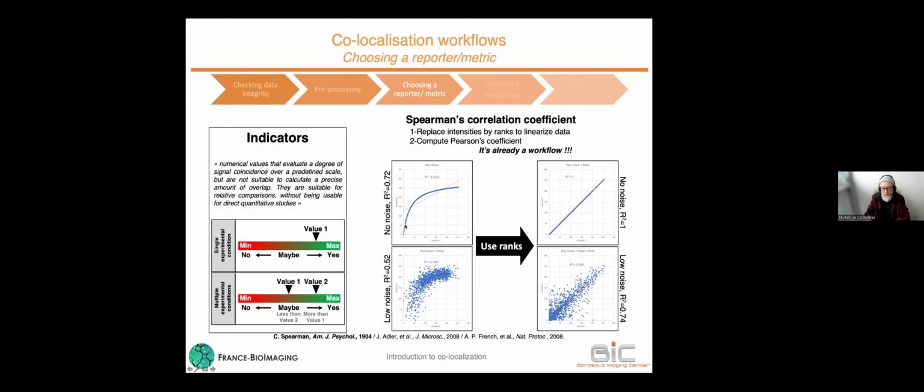This one might be the 10th value on the range, so I place it on the 10th tick within the axis. This way I can linearize the signal, and I can now use the Pearson coefficient. And you see that it makes a huge difference.